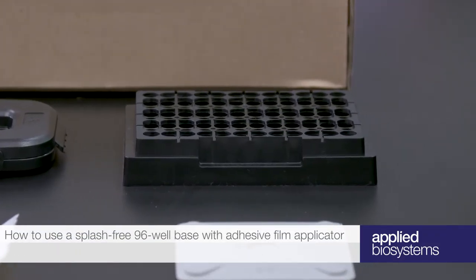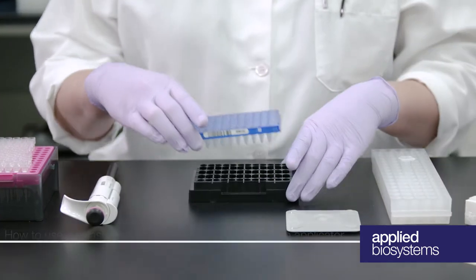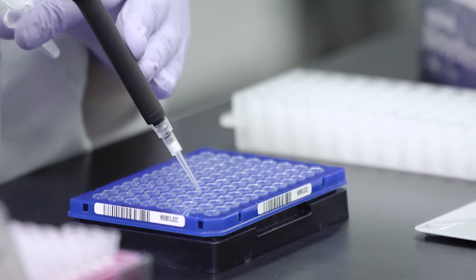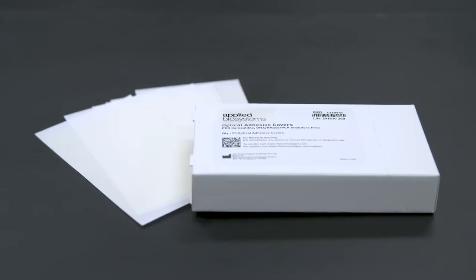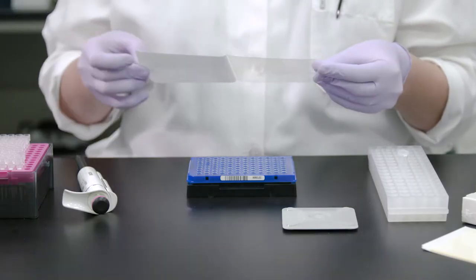To use the splash-free 96-well base with film applicator, first place your PCR reaction plate in the plate rack. After pipetting your PCR samples into each well, remove one of the adhesive plate seals from the package and remove the backing of the adhesive film.